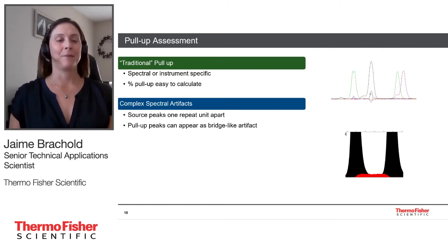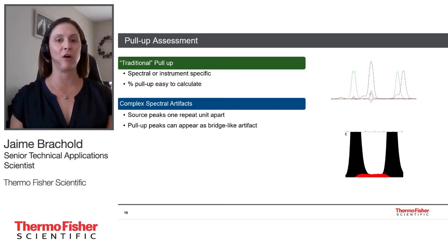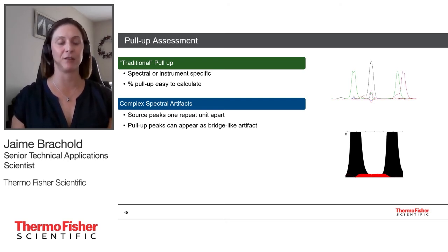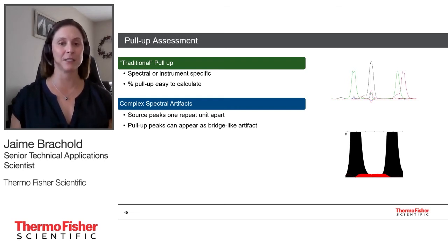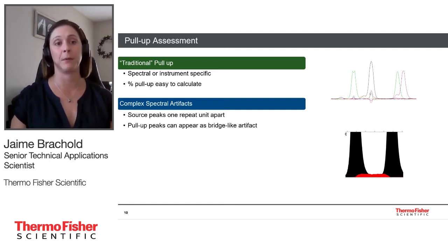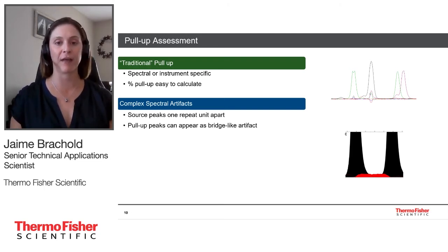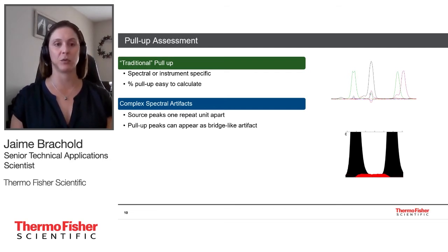I want to clarify the term 'complex spectral artifacts.' Traditional pull-up falls underneath a parent peak and has an easily calculable pull-up percentage. Complex spectral artifacts are pull-up peaks where it's more difficult to identify the parent peak, or they exhibit a bridging or pull-down effect where peaks are counted as spectral artifacts but a percentage to a parent peak cannot be calculated.